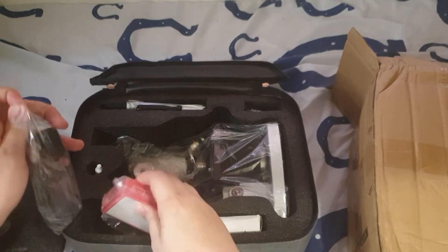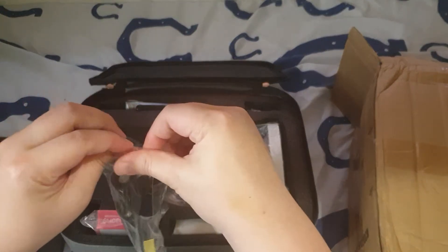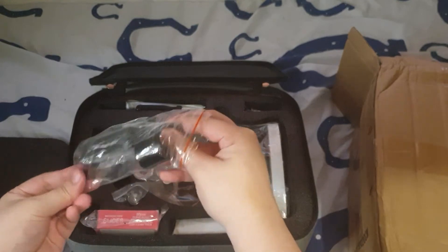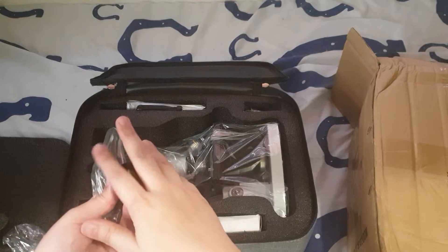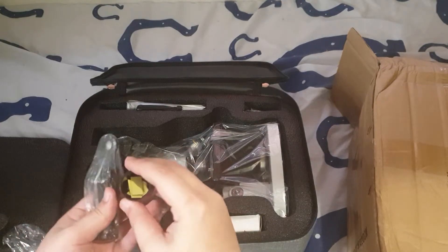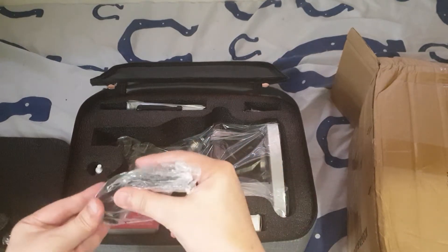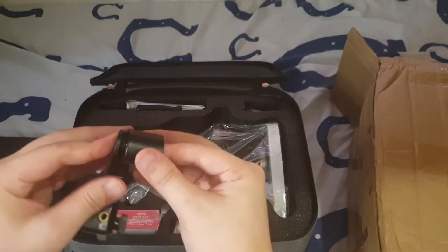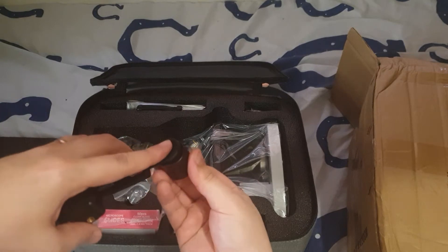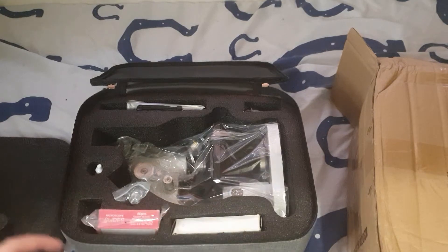What else do we have here? This is the eyepiece for the camera. I'm not sure exactly what that is — it's got a bunch of sticky tape. You put your camera and load this into the eyepiece; it's common in a lot of telescopes. I'll put that back later.